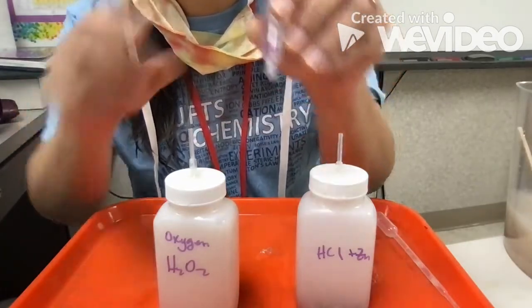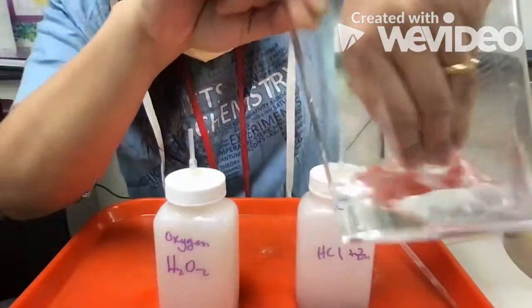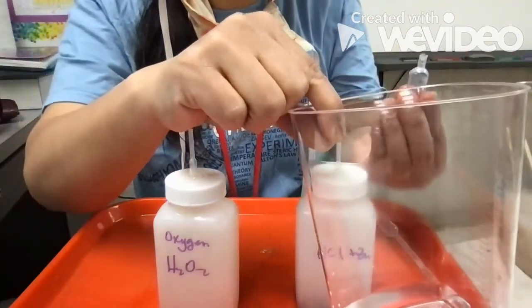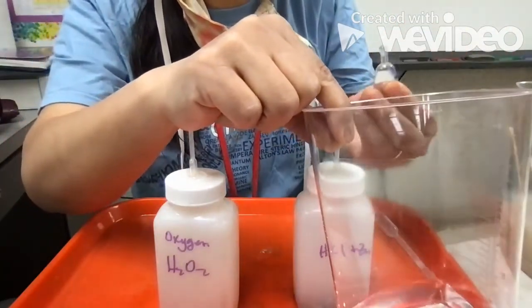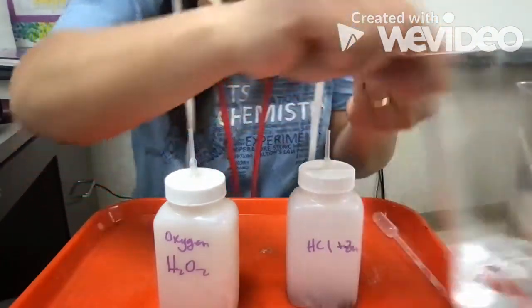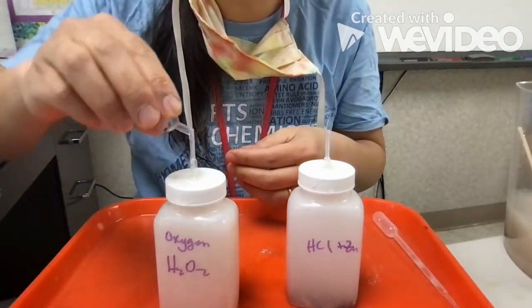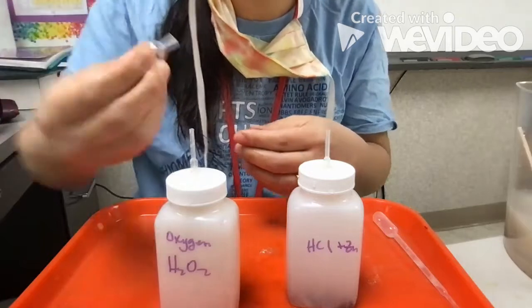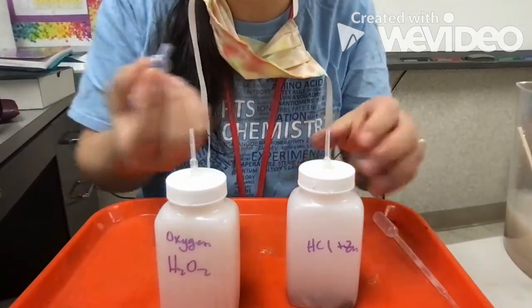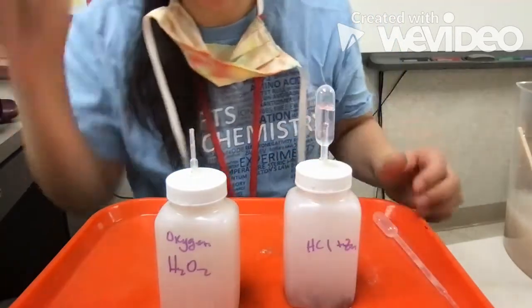Okay, and remember, first we got to fill this up with water again. So go in here, squeeze, let it go, turn it over. Okay, squeeze it again, put it in here, let it go. Now it's completely full. So I'm going to collect some oxygen, 1 part oxygen. Okay, and then turn it over quickly. Oh, that was a little bit more than 1 part oxygen. Okay, and then we're going to collect the rest as hydrogen.